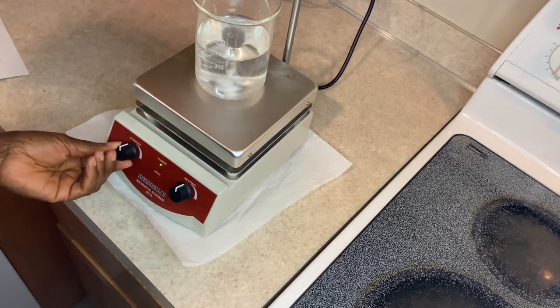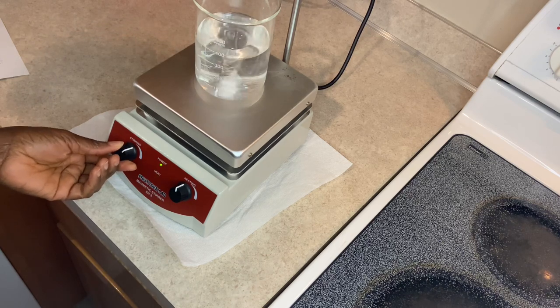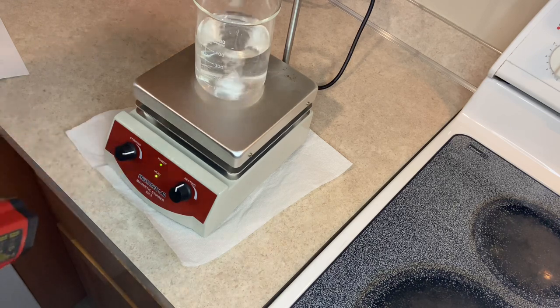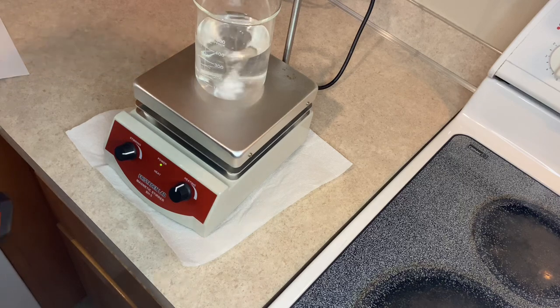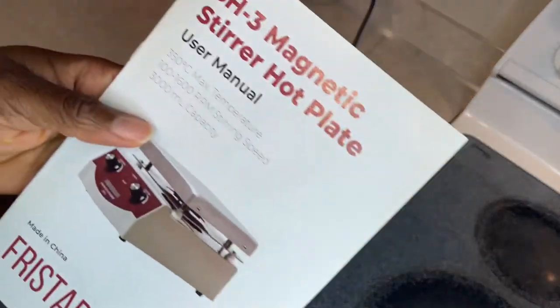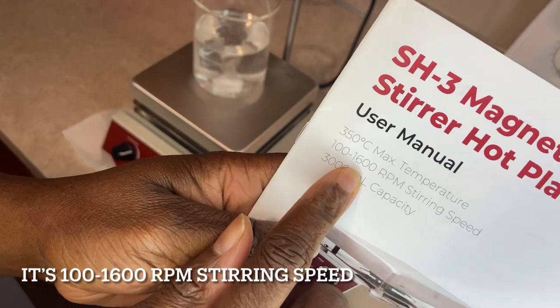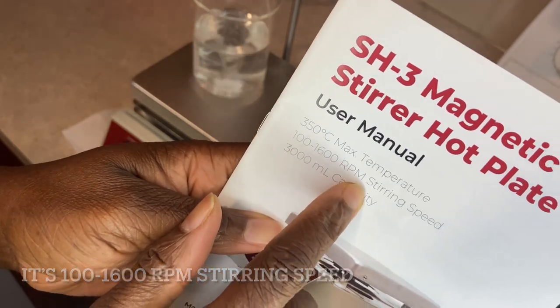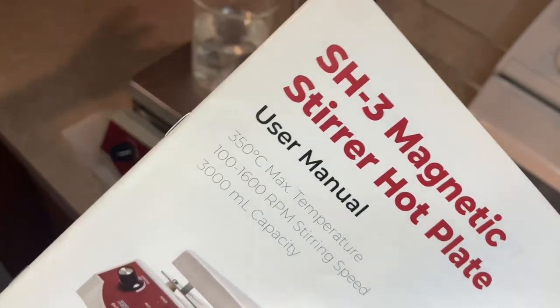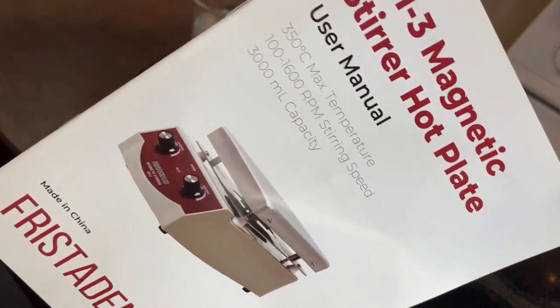And you can go all the way up. Look at that! This looks like it can homogenize lotion, because it goes up to — I think it's 100 to 1600 RPM. So this will homogenize lotion, I believe. I need to try and see — I will do a test. This will be so nice.